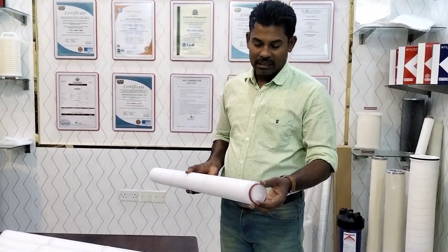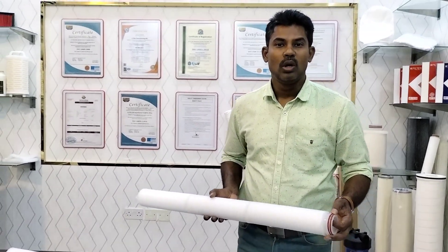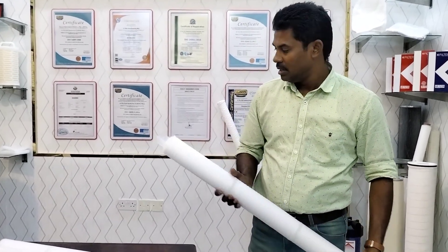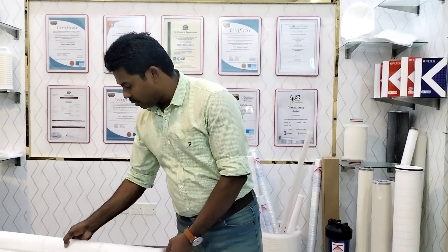The connections available include double 226 with fin, and we can also make triple 222 with fin type. We can also make double-double and open-end sizes. We can make several configurations as per customer request.